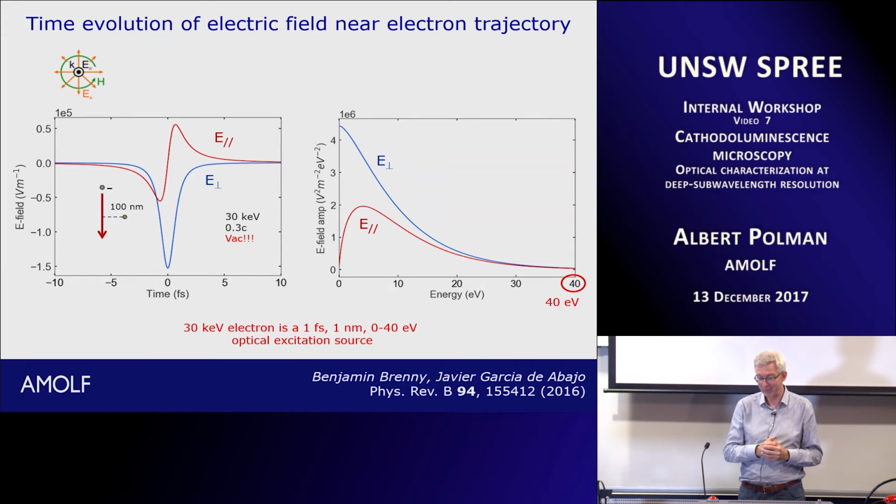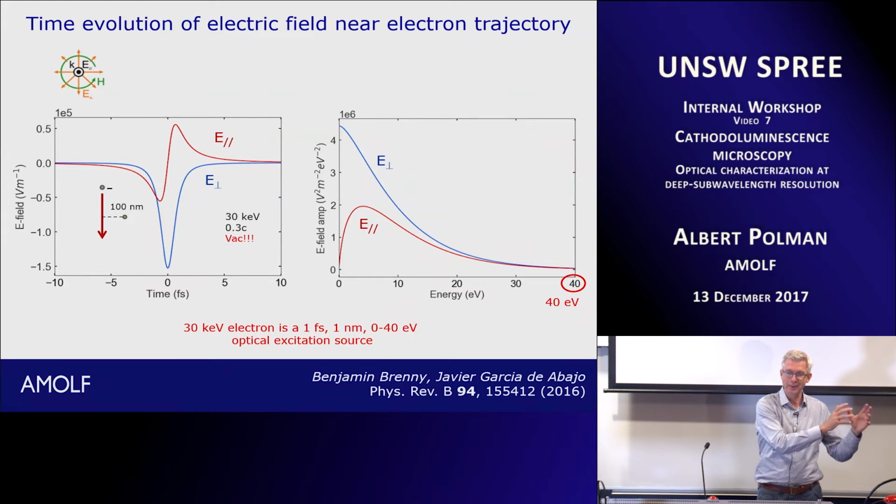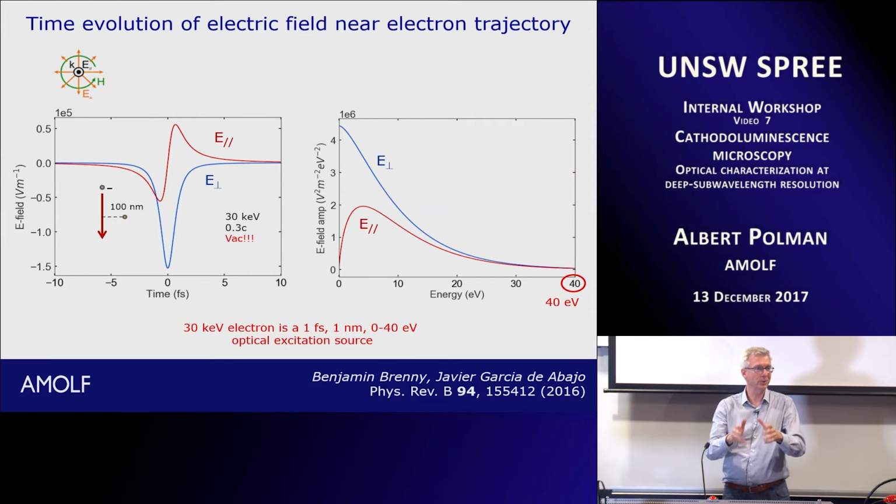Right? And really in our lab, we use lasers less and less to do spectroscopy, because we make samples in the clean room. Then they have to go in the SEM. We have to check if the lithography worked out well. And then, well, you might as well just do the optical experiment in the SEM as well.